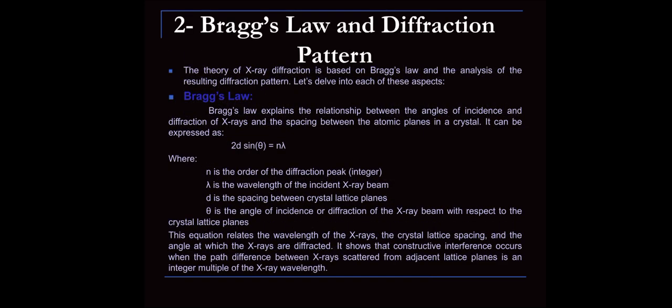Now, second, Bragg's law and diffraction pattern. The theory of X-ray diffraction is based on Bragg's law and the analysis of the resulting diffraction pattern. Let's delve into each of these aspects. Bragg's law explains the relationship between the angles of incidence and diffraction of X-rays and the spacing between the atomic planes in a crystal.